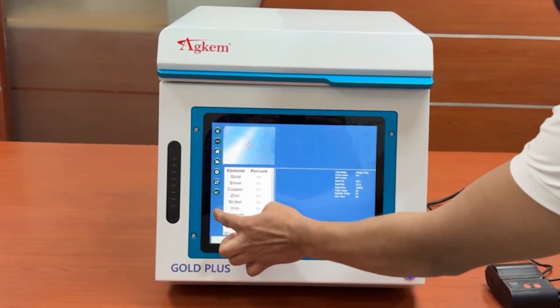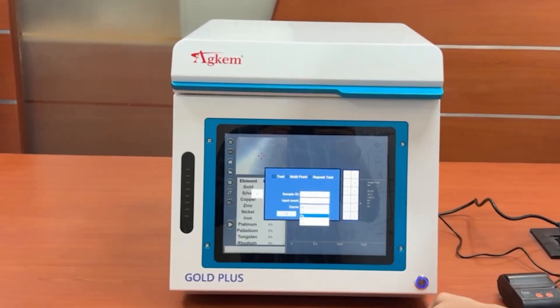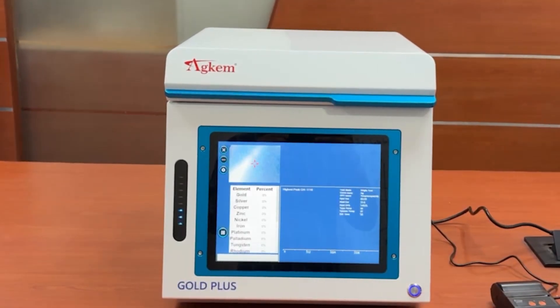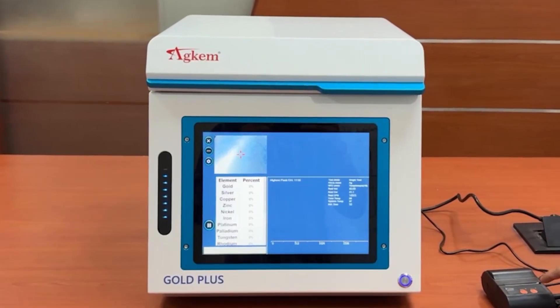Place the sample in the center of the red cross. You can choose test curves here. Click the test button — you can also choose test curves here. We chose a U-curve. It will get the result in 50 seconds.